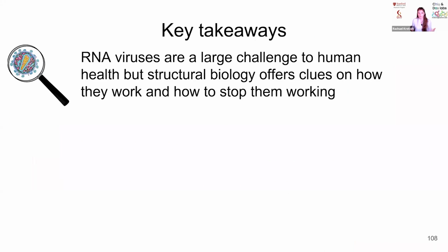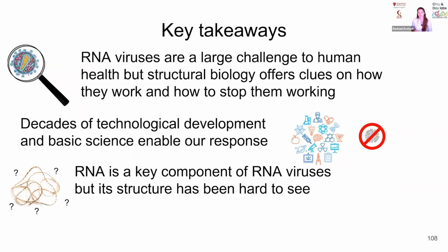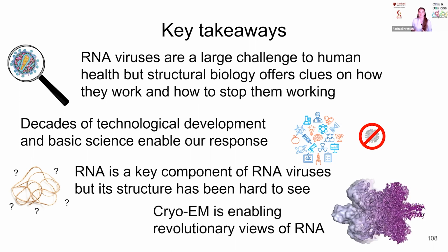And our key takeaways, well, RNA viruses are still a huge challenge to human health, but we hope structural biology will offer clues on, first of all, how they work, and then secondly, how we can stop them working. And decades of technological development and basic science have enabled our current response. And we hope our basic science work on RNA structure will enable future responses to disease. So RNA is a key component in RNA viruses, but its structure has remained hard to see. So we're working on developing the basic science through Cryo-EM to enable these revolutionary views of RNA in the hopes that we can learn about viral RNAs and how to stop them working.